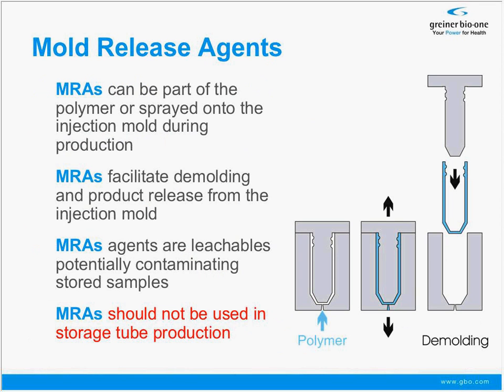So I mentioned mold release agents as one type of contaminant or additive one can be confronted with if one uses labware made of polymers. What you see here in this little cartoon on the right-hand side is an injection mold. It's, of course, oversimplified. The gray portion is the actual injection mold, and on the left panel, you see the mold being closed.